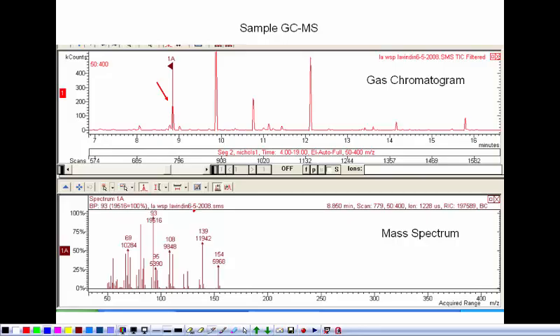what's typically done is to use this set of peaks as a fingerprint for the molecule. And so this idea that there are different masses of different heights gives you a mathematical sort of fingerprint for the molecule that can be searched in a database to try and figure out what is close to it.